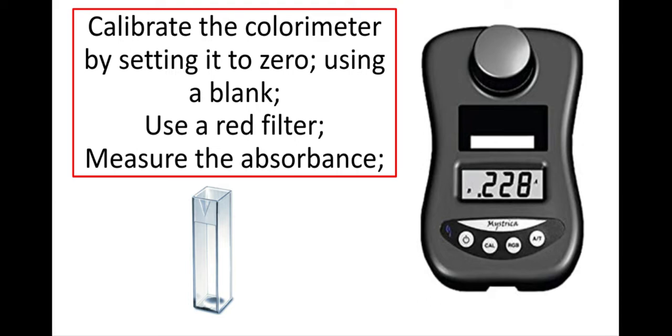It's also very important that I use a red filter. So I'd press this button here which stands for red, green, or blue filter so that I get a little R in this corner here, because I'm going to be looking at a red filter and I'm going to be measuring the absorbance. So the absorbance is the volume of light that is absorbed by my sample.